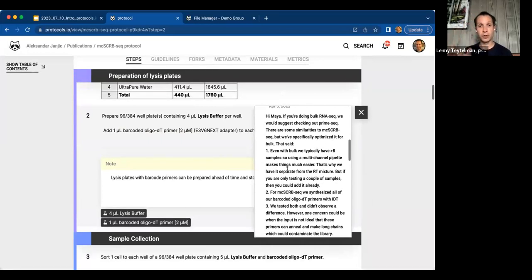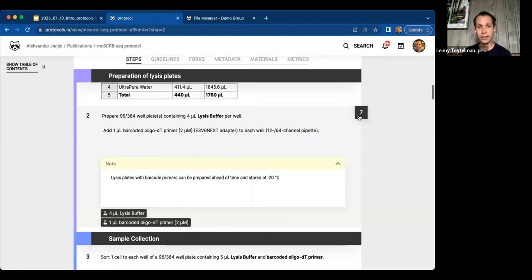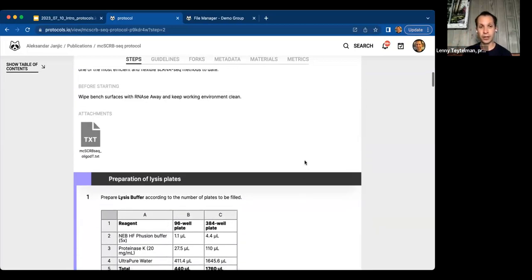Again, just like protocols themselves, you decide whether you're asking something publicly or privately, even if it's on a public protocol. But when the comments and discussions are happening in public mode, you're sort of building up an FAQ right on the steps of the protocol that everyone can come to and see without having to email the authors and without you as an author having to answer the same question over and over. You can point people to the answer, or hopefully over time, they see the answer in protocols.io and don't even email you for it.